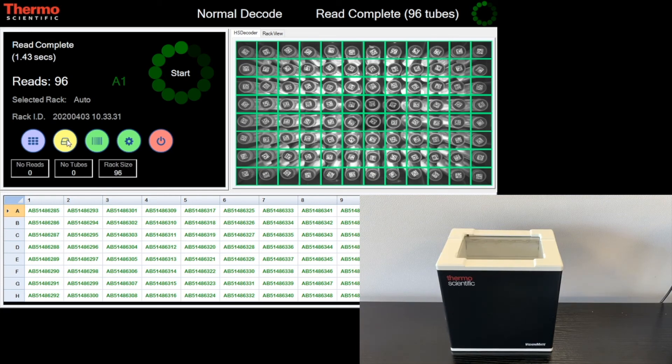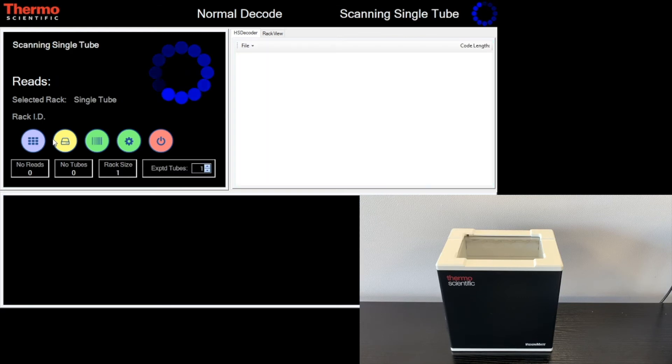Features also include a single tube mode, allowing processing of one test tube at a time.